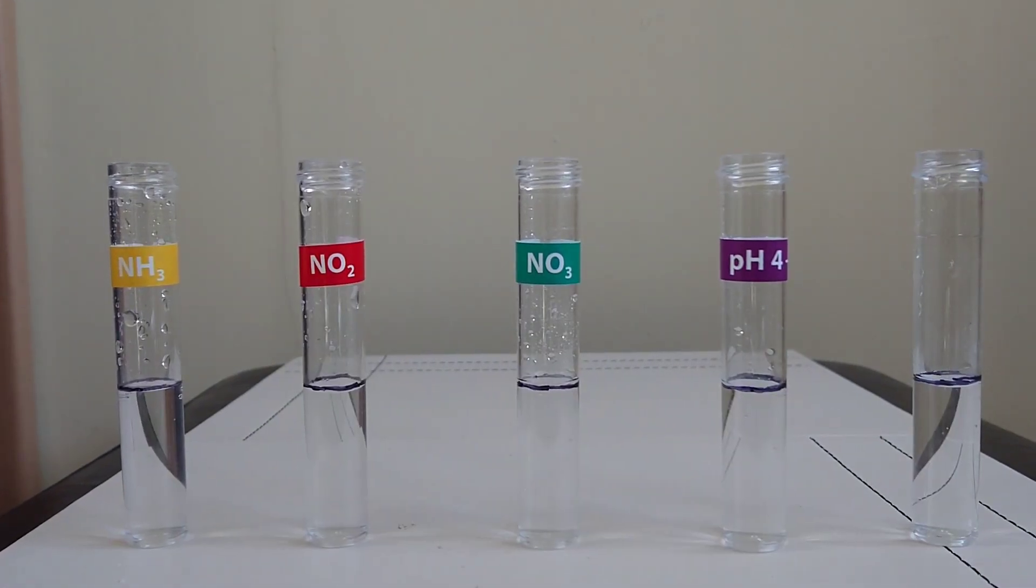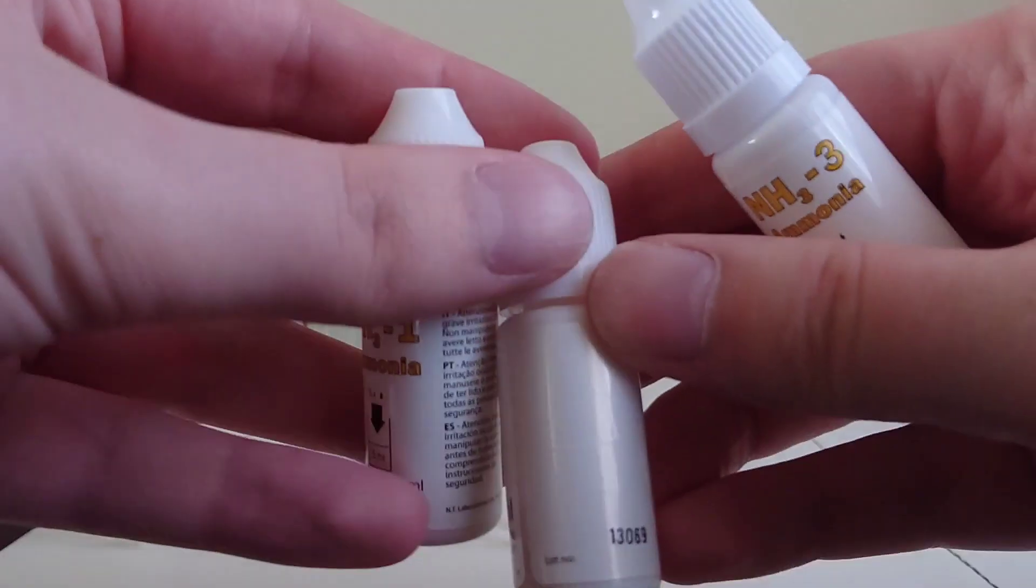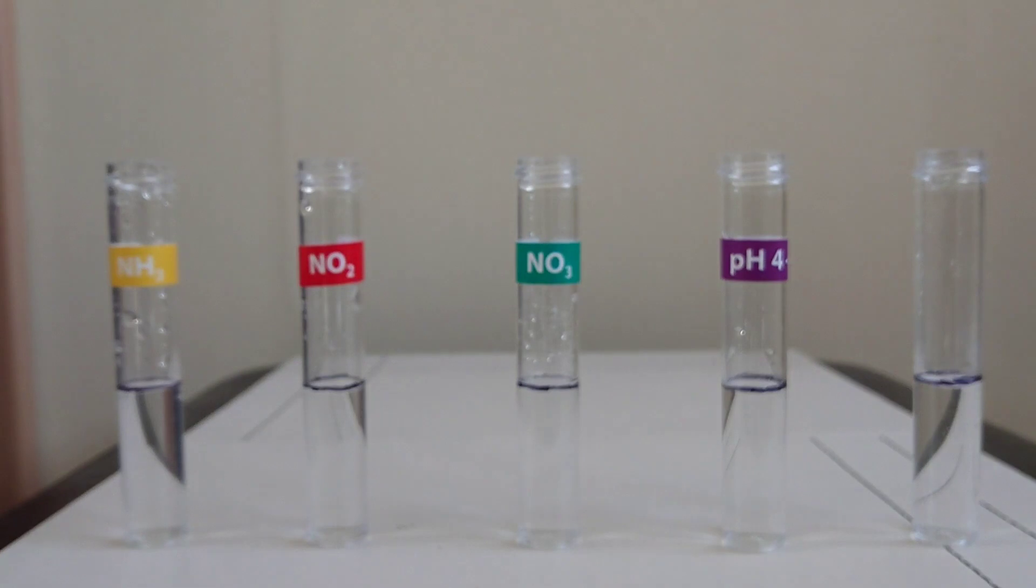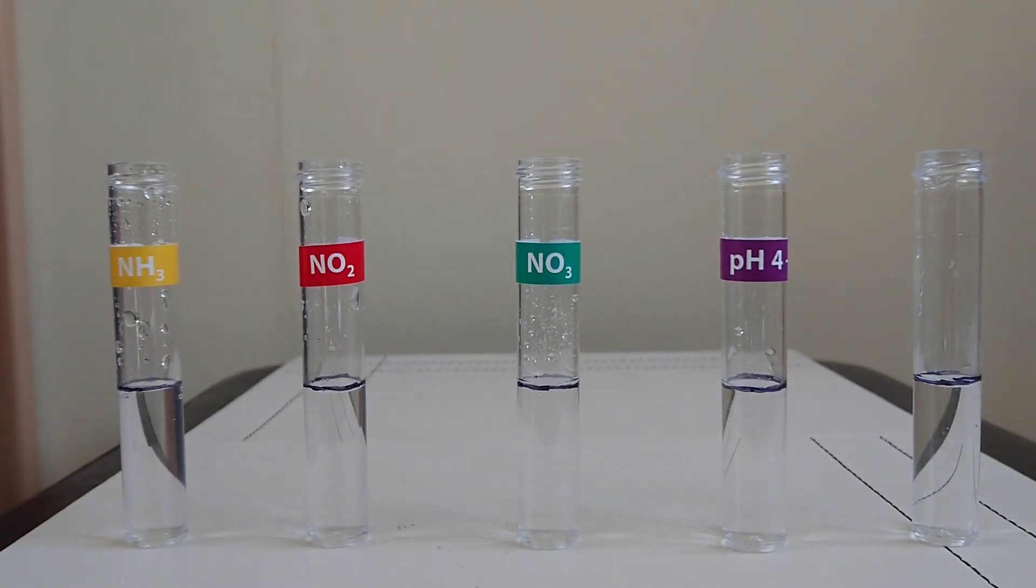So that's all those filled. First up, it's the ammonia test kit. This has three bottles and you put in five drops of each, and then give the test tube a good shake. It takes ten minutes to develop.